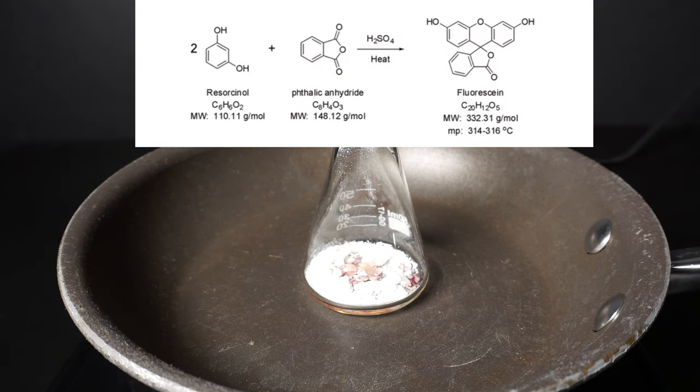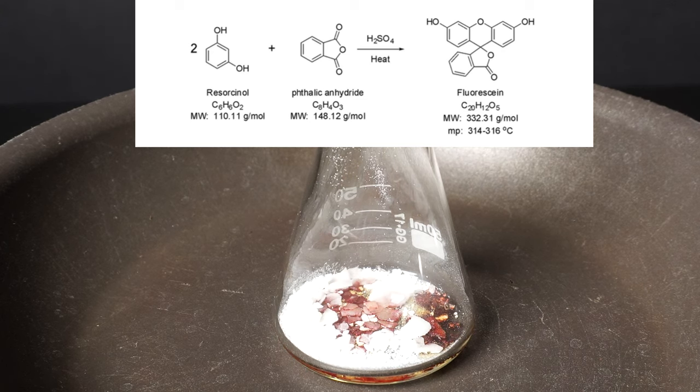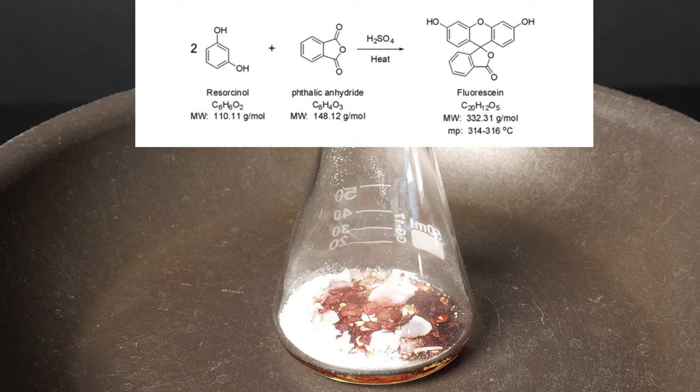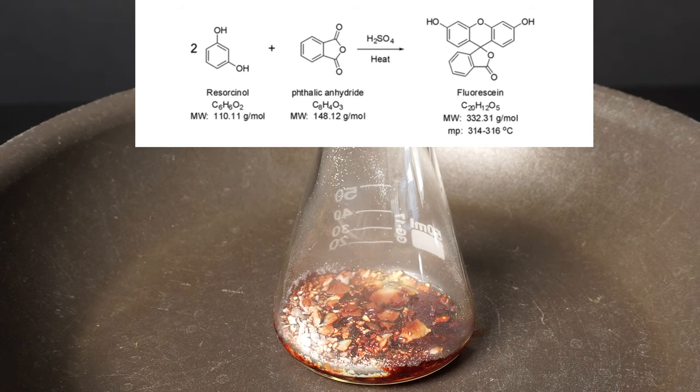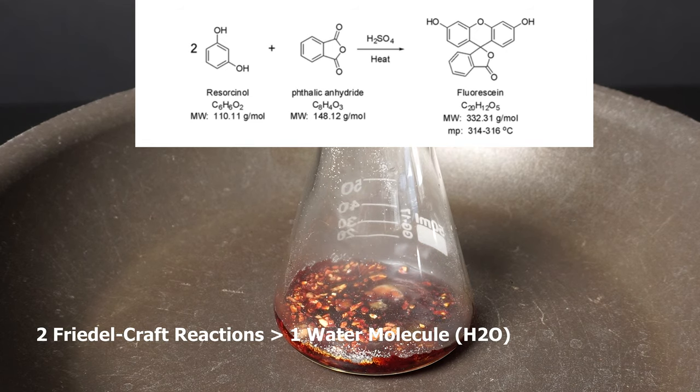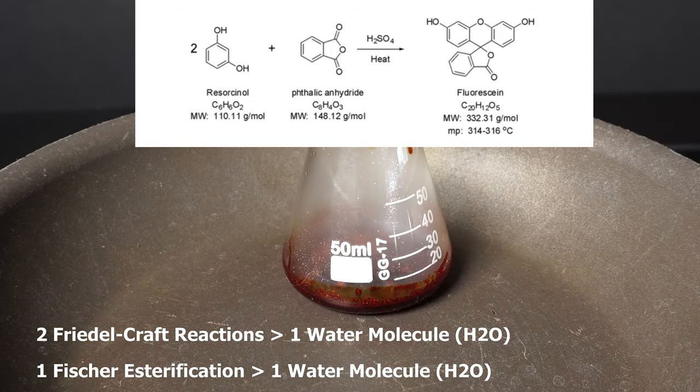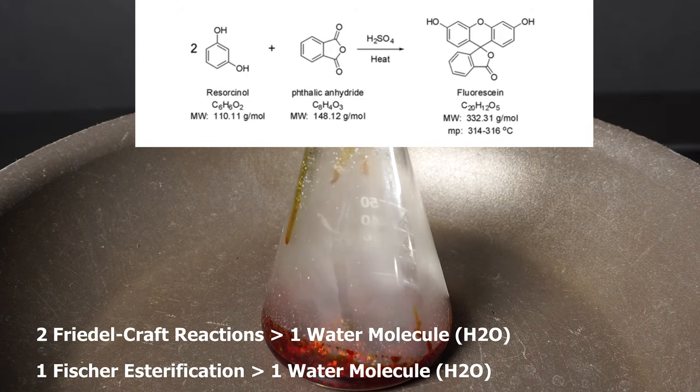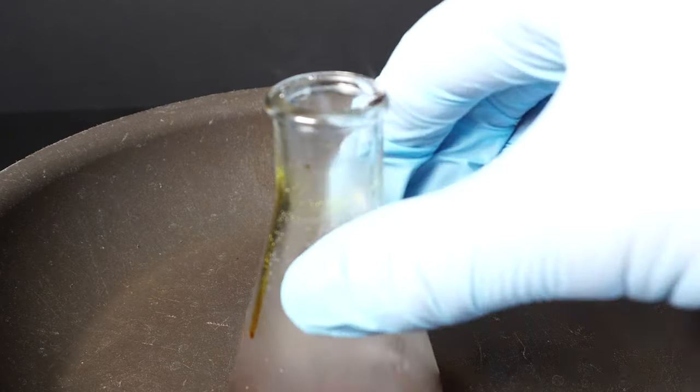As soon as we turn on the heat, we see the reaction start to take place. We can see a red oil forming, and I have listed the reaction that is taking place. There are actually multiple things going on here, but without getting too much into it, there are two Friedel-Crafts reactions that give off a water molecule, then a Fischer esterification giving off another water molecule. But that is a very basic explanation of what's going on.